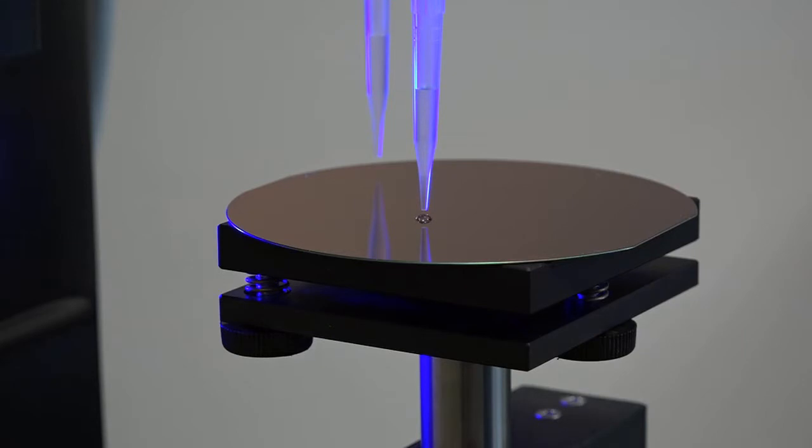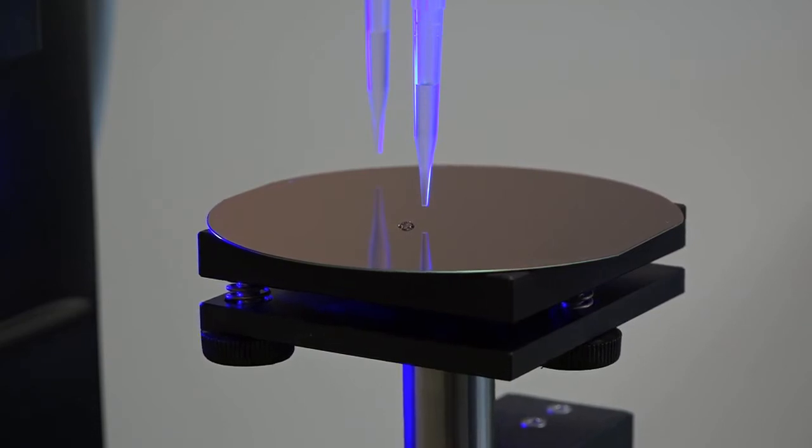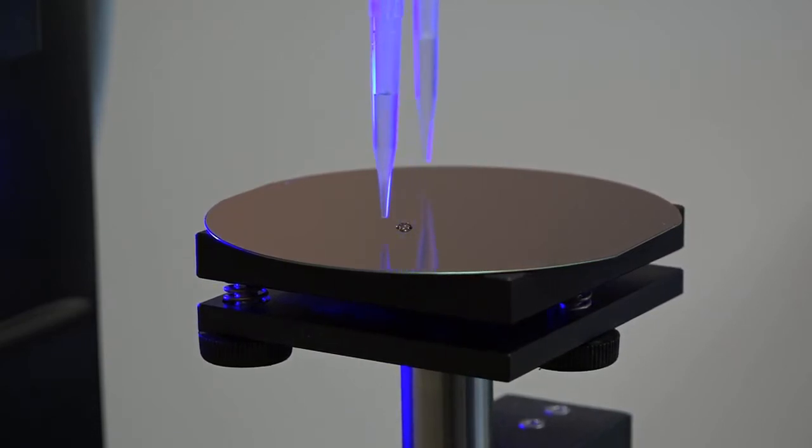After the contact angles have been analyzed, the automatic stage moves to its next position and the second dispenser is being brought into the image. Then the second dispenser creates another droplet and places that again automatically onto the surface using a precision movement.